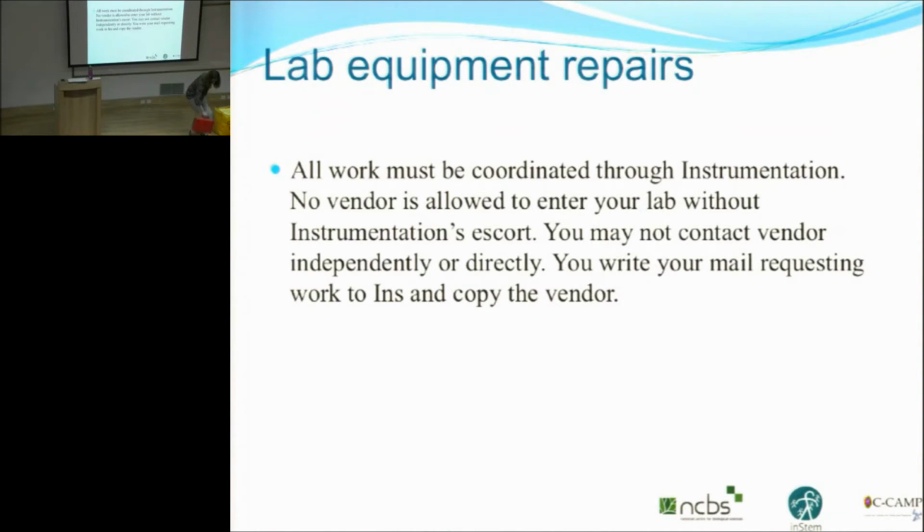Realize that we have mercury spill kits. They'll be in the lab support office, and we keep them near the chemical spill kits on the first floor here of the Southern Labs. So if it's late at night and lab support is closed, you can get that. If you work with a significant amount of mercury in your laboratory, you can get a kit through stores so that you can do it.